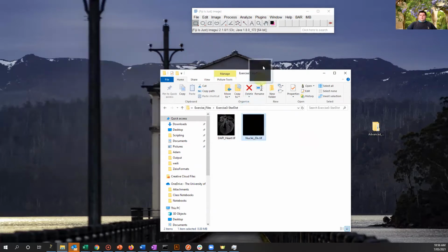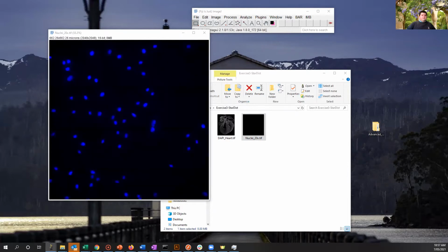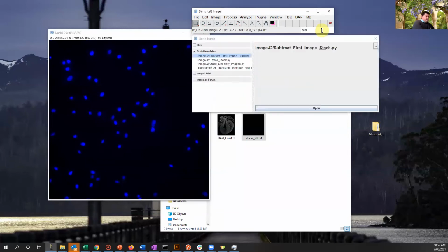Now, you don't have to use it on a tissue section. You might have an image where you just have a number of nuclei from transfected cells, for example. So here we've got a DAPI stained image of a number of nuclei. We can go back to that StarDist.